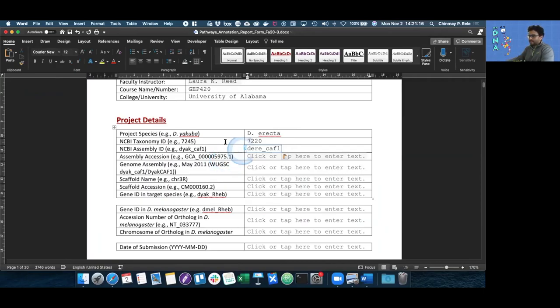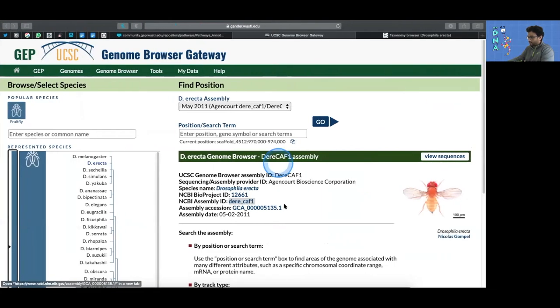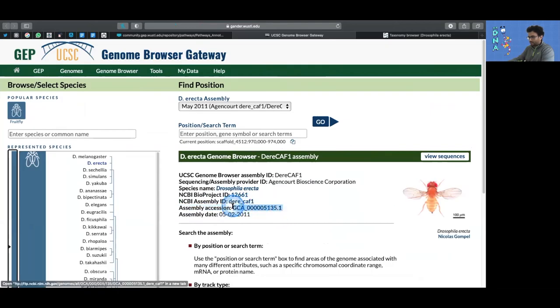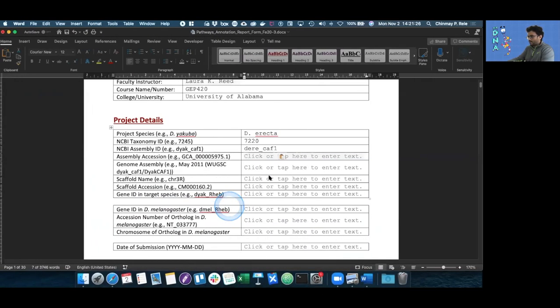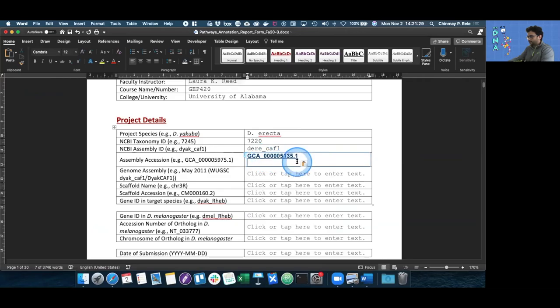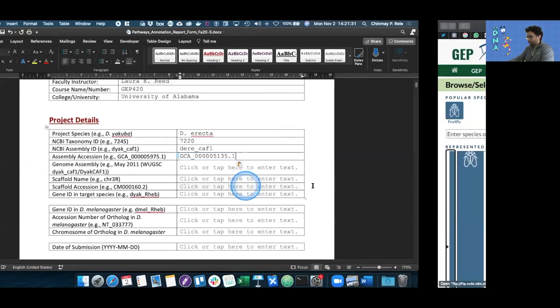Next, we need the assembly accession number, which is on the same page as your genome browser. It's right there, the GCA accession number. Once we've found it, we just have to copy it, go back to our document, paste it, and as always, keep text only.